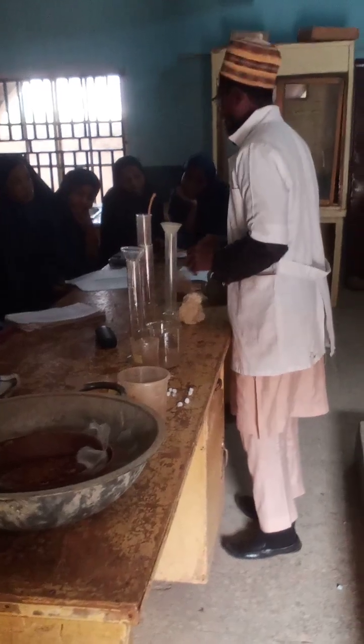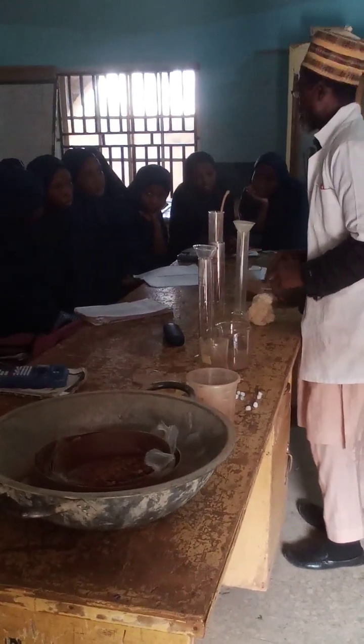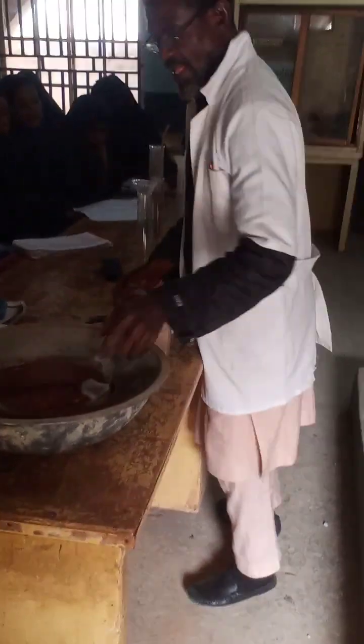You have three types of soils, the commonest three types of soil. Mention them. Sand, silt, and clay soil. So the three soil samples will be provided.